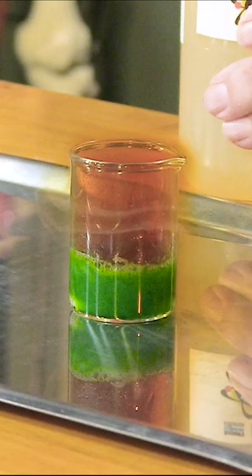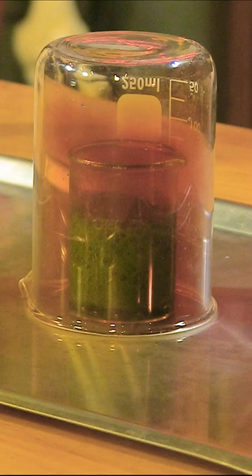Uh-oh, something's happening. Look, the liquid's turning green. I'm getting gas — you see that brown gas coming? That's nitrogen dioxide, and that's deadly.